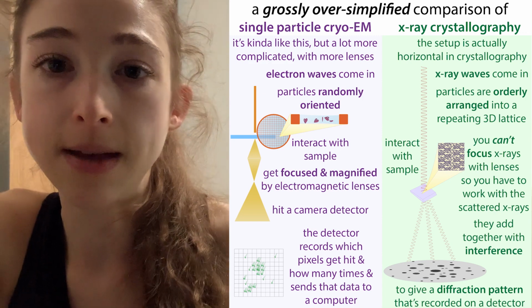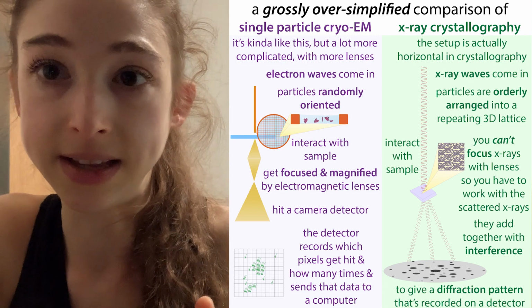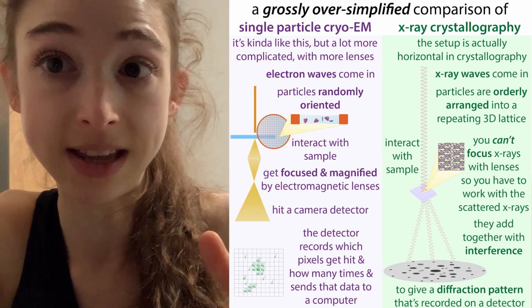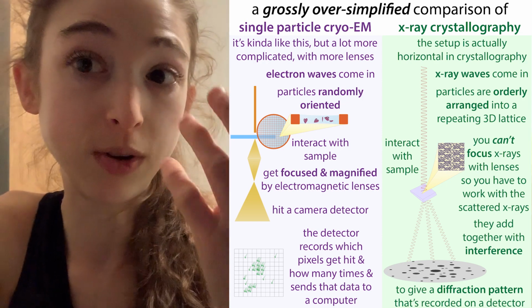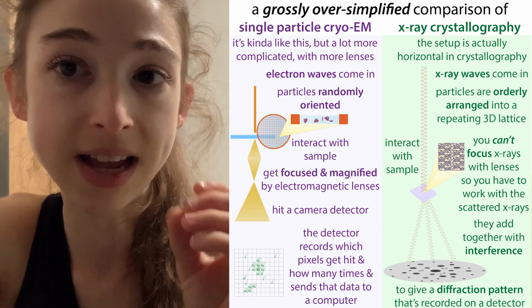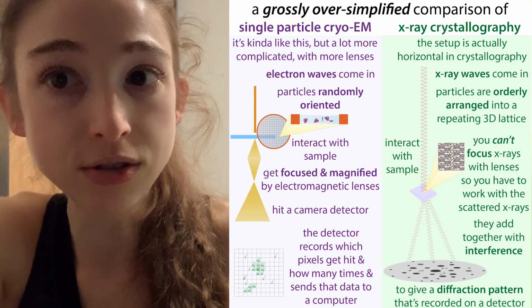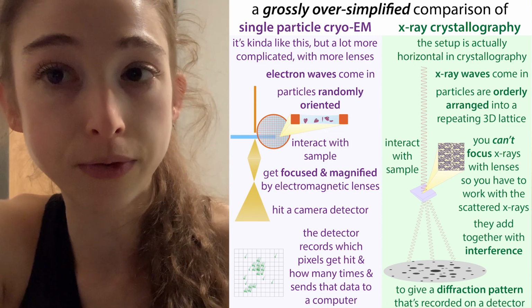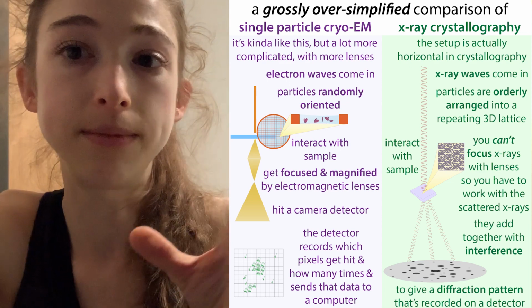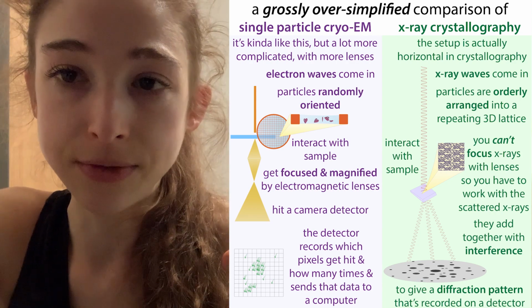But yeah, so with cryo-EM, a few years ago, you could only use it for really, really big things where it's a lot easier to tell that this is not background, this is actually my thing. But now with the advancements, you're seeing the size of the molecules that you can actually image go down and down, as well as seeing the resolution of those structures improve. So cryo-EM is often used to solve the structures of complexes, or really big stuff.